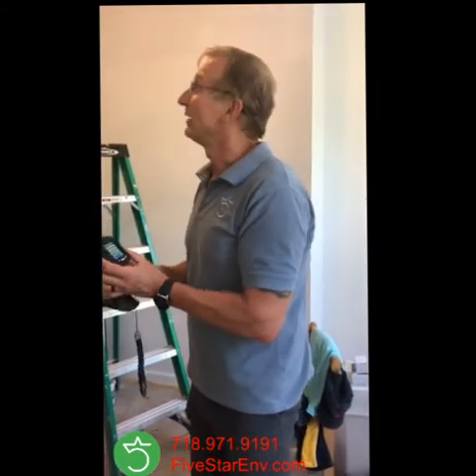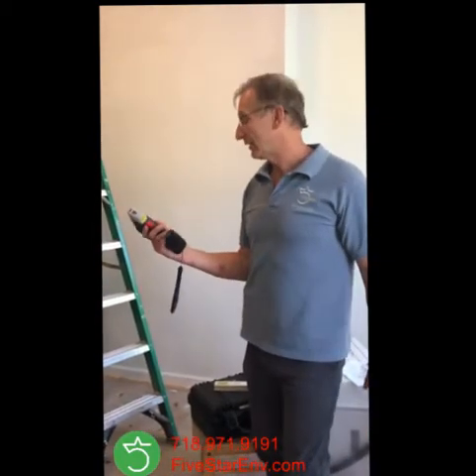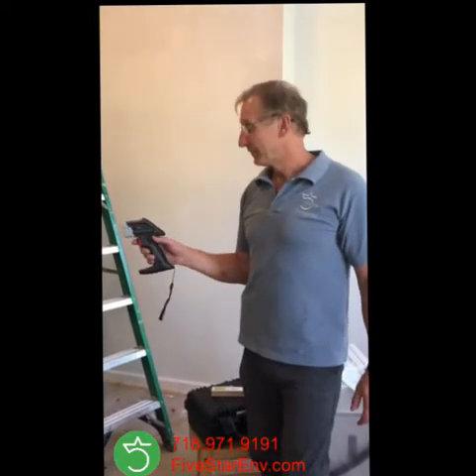It's positive. A landlord would have to be careful with this and maintain it in good condition, because if this starts to deteriorate, it may create a lead hazard. As you can see, this instrument is a very quick method of finding out if you have lead. I can very quickly do the whole apartment.